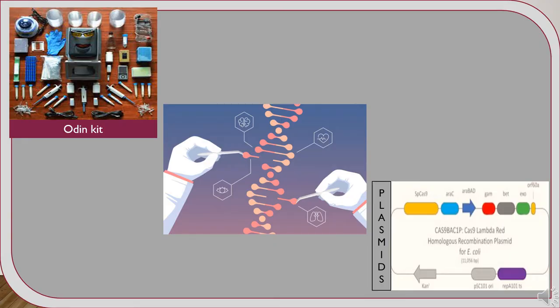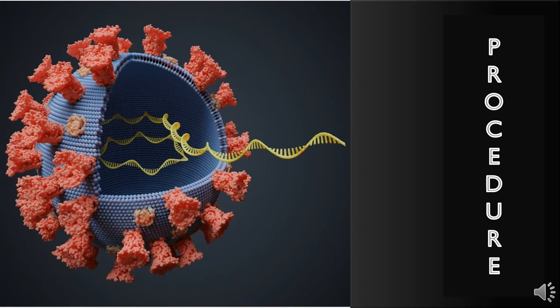For the procedure, we need some items, but mainly to be specified are the Odin kit and plasmids. When we receive the kit, make sure to store all the perishables in the refrigerator or freezer as advised in the kit manual. We will prepare enough bacteria transformation mix tubes to do 4 CRISPR experiments — testing with and without the DNA template, each in duplicate to ensure reproducibility. We will prepare the CRISPR reaction according to the provided table, label our plates accordingly, and inactivate our modified bacteria with 5–10% bleach before disposal.